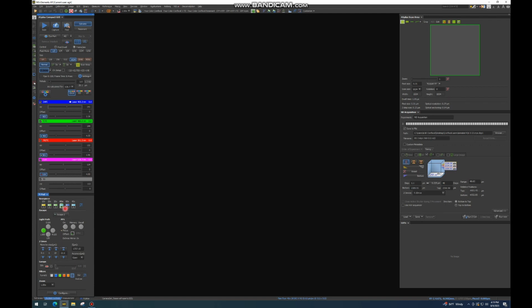It is really, really important that you never get oil on the air objectives. If oil gets on the air objectives, it will actually degrade the lens and cause them to break, and it's very expensive to repair. For that reason, we ask that people go into their imaging session knowing which objectives they're going to use and decide if they're going to stick with air or stick with oil, because you can't go between the two.